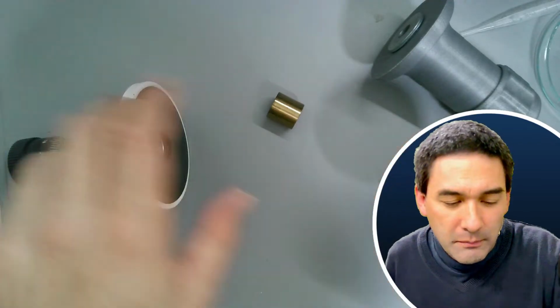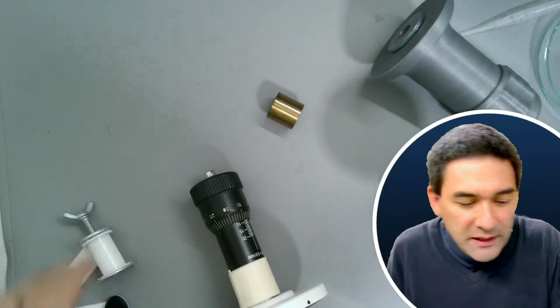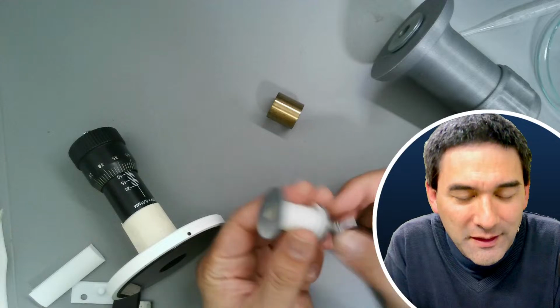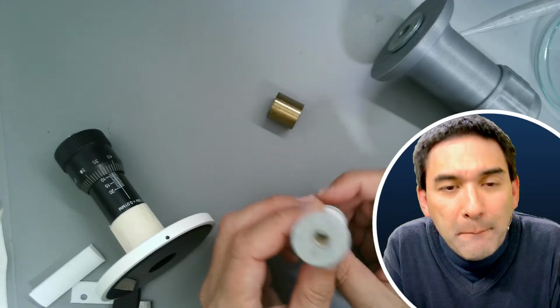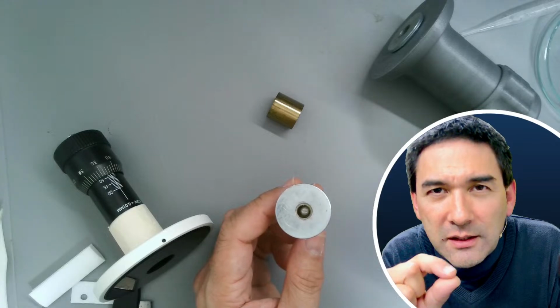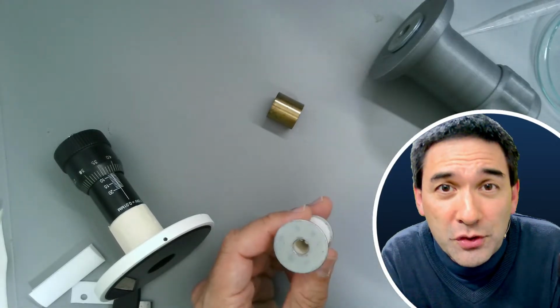Some of you might have already seen them before from different videos that I made. I'm going to start here with this small one over here. This is a homemade version of a microtome. First of all, for those of you who don't know that yet, microtomes are there to make very, very thin cuts of tissue, so that we can put it on a microscope slide.